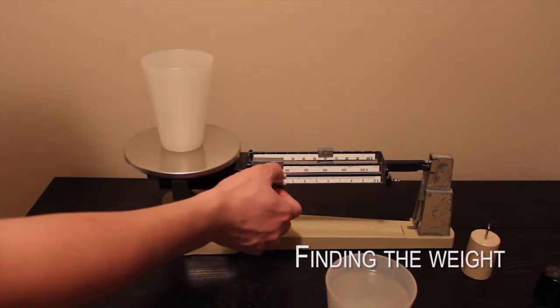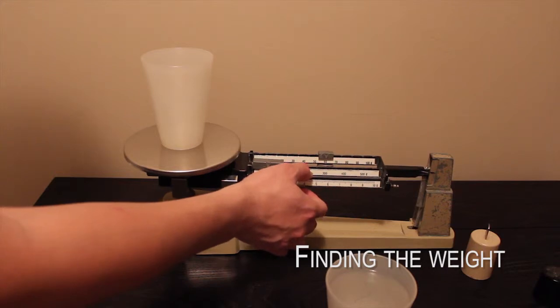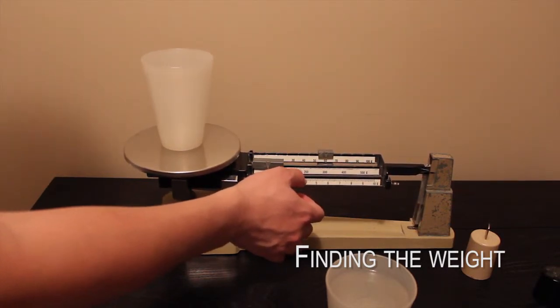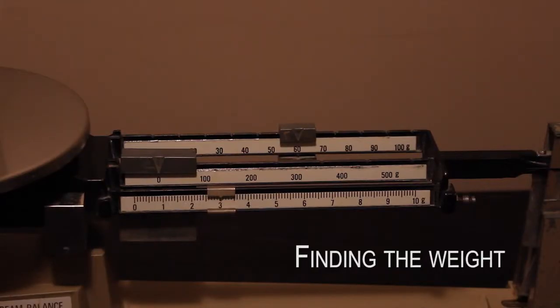Then, adjust the last beam's scale's 0.10 gram weight until the balance pointer reaches the middle point. The scale is now balanced, and is ready to be read. This cup of water weighs 63 grams.